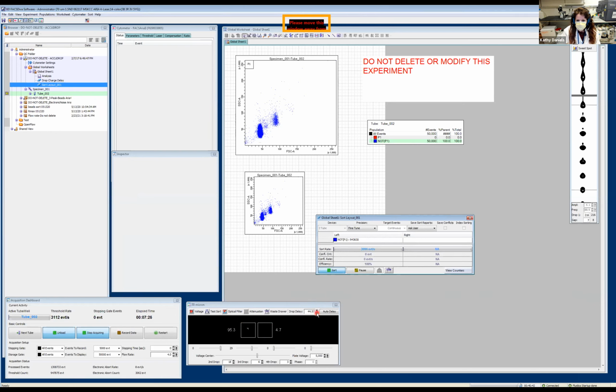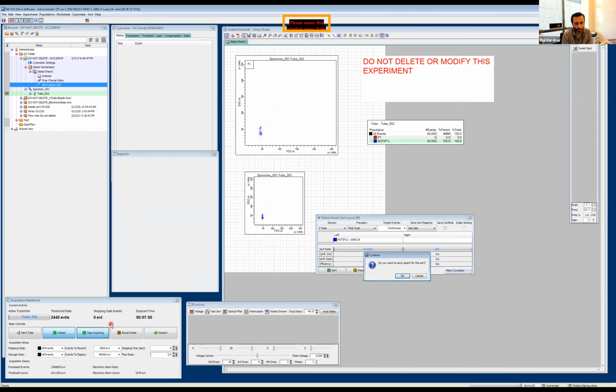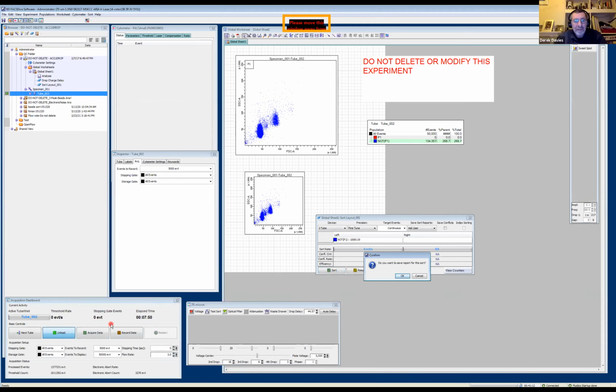Kathy, sorry, we have a few questions that came in. Sure. One of the questions, and I don't know exactly what they mean with acoustically, but I think I understand the question. The question was "acoustically not understood. What is the excitation and emission from the beads?" I think it may mean they just didn't hear what Kathy said.